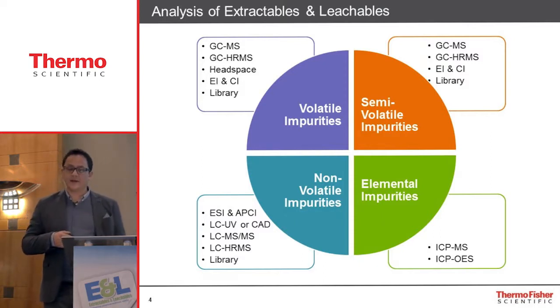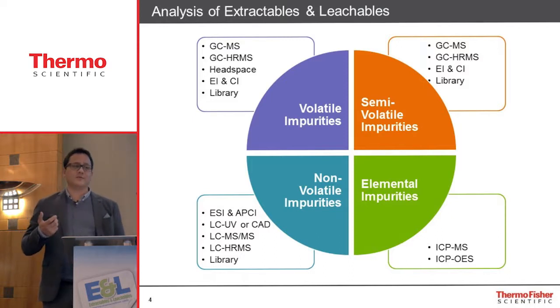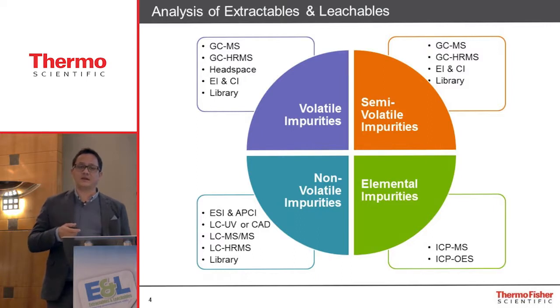And I think it's fairly safe to say that conventionally, mass spectrometry has really led the way in identifying unknowns. And as instrument vendors, we recognize that many people within the industry have reached out to us in the past requiring additional capabilities.